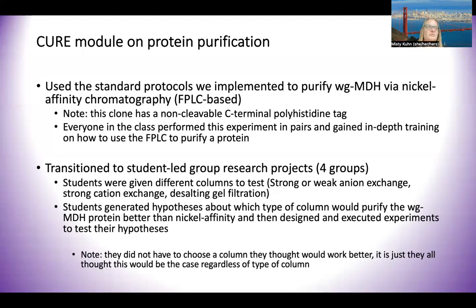And I think at the very beginning, it was really around, can we even use any of these other kinds of technologies to purify this watermelon protein? The motivation behind this was mainly, at least on my end, to ensure that students were getting more background than just nickel affinity chromatography, so they could get some practical hands-on skills, because at least in the Bay Area, being able to purify proteins is a very marketable skill. And so I'm really interested in connecting techniques that are needed in industry to training in students, so students will have jobs after they leave.